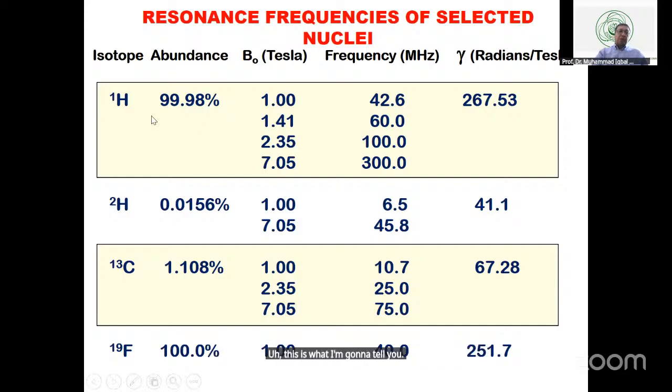You also wish to understand and appreciate that proton and carbon-13 are so different from each other. Proton is nearly 100% abundant. Carbon-13 is only 1% abundant, so it's always very, very weak. On top of it, it is a poor magnet as compared to proton. And as a result, the Larmor frequency is much weaker. The population difference is very low, and it was a huge undertaking to detect carbon-13 in natural abundance.